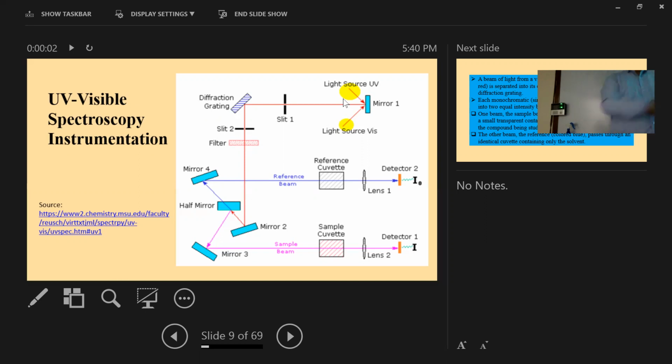Is it? Because the rest of the light is blocked here. Only a very small hole, so that the light is not wide, just a certain area, maybe 1 centimeter or 0.5 centimeter like this. So we are getting light like this, wherever I point the pointer. Then we have this one as a grating.